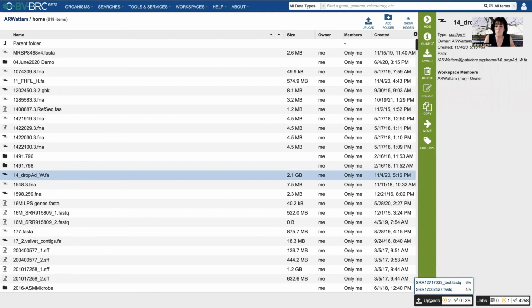So we're all still waiting on the uploads. When you're at home, wait until it's uploaded before you do anything with it. And if you are having troubles uploading, and I sympathize because it happens to me all the time, you should try to learn to do the command line specifically for uploading, because that makes it a whole lot easier.